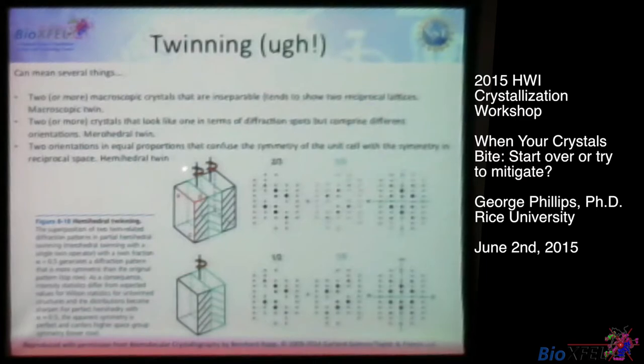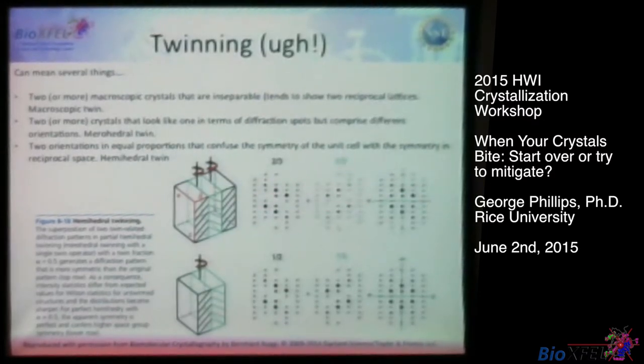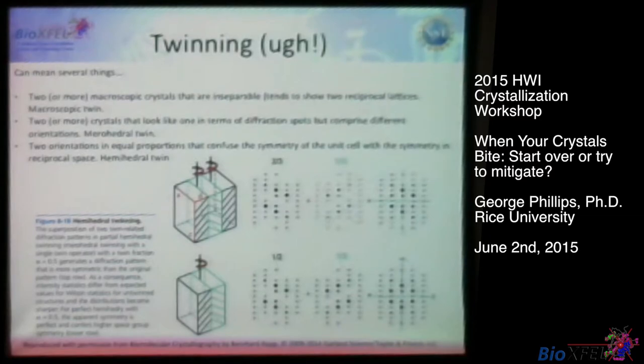It requires some knowledge of crystallography to understand these twin laws, that is, the relationship between the spots, the rotation axis and the rotation axes in reciprocal space that put these diffraction patterns on top of each other. Different space groups have different common twin laws. If you've only got one kind of twinning going on at a time, the chances are you can save this kind of crystal these days, but it is possible that you've got twinning going on in more than one direction, which is pretty much the squish it and start over step if you're trying to get your Ph.D. in finite time.